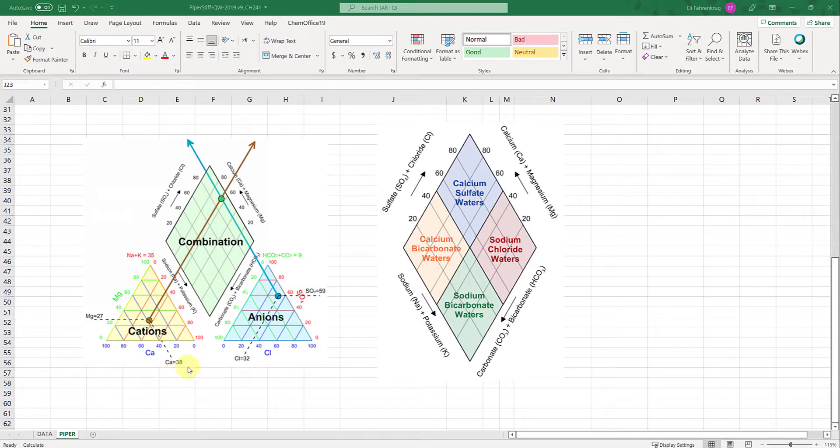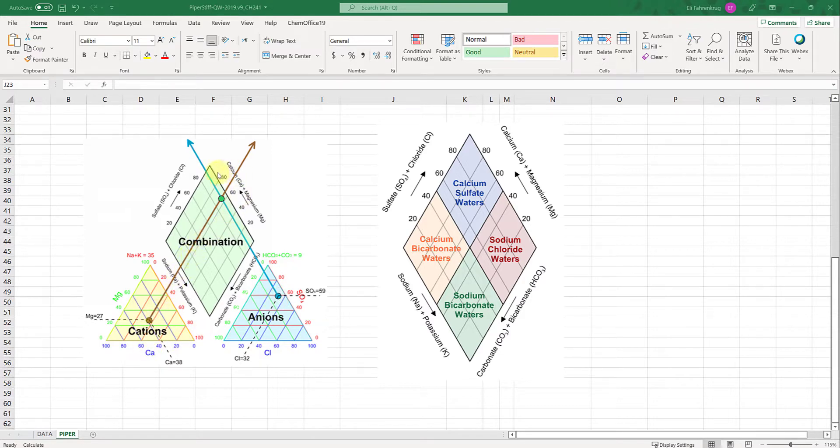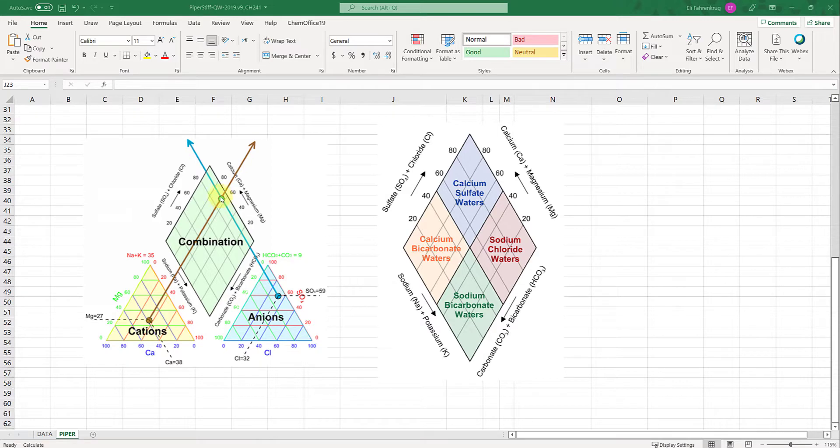For a single sample you'll have one point in the cations and one point on anions. The plot extrapolates a straight line up to the diamond and similarly for the blue line for anions. Where those points intersect, a new point is generated on this diamond combination plot.